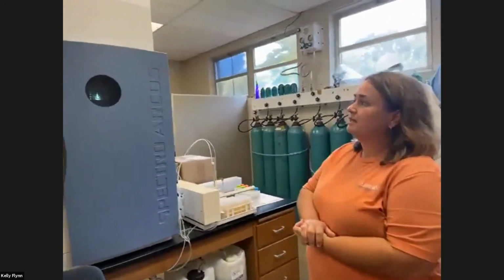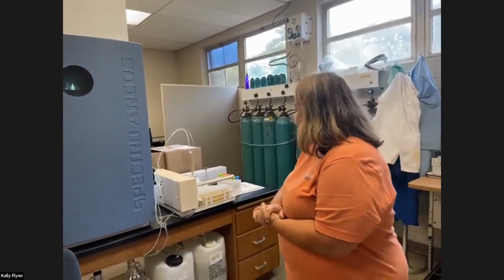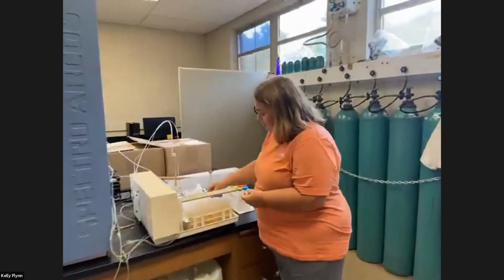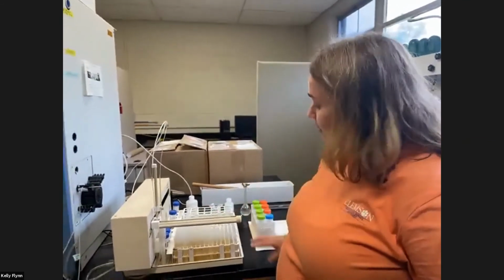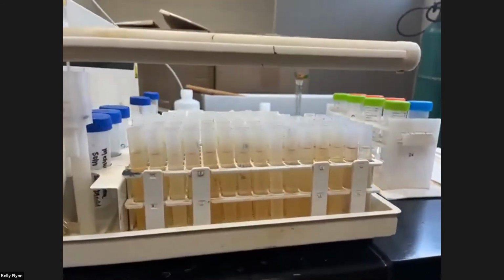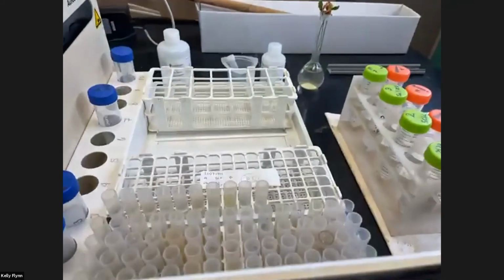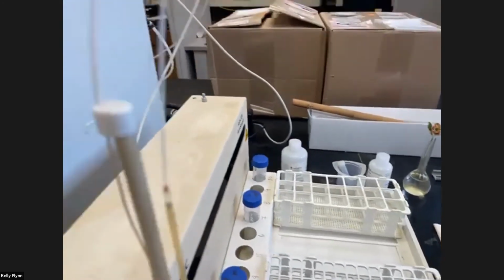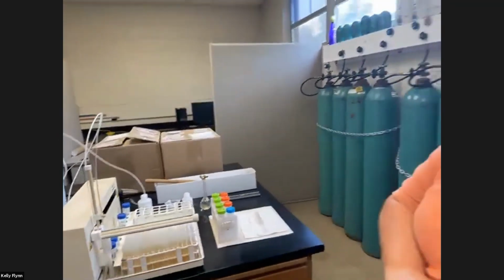This is our ICP, inductively coupled plasma. If you remember, Shannon mentioned that we have these tubes in the funnel. So that's what we end up with. We end up with 100 samples that are in the batch. We have to be really careful, everything stays in the right order. So we started out with that solid sample, and we added that extraction solution. So we end up with a liquid sample that we are going to actually run on the instrument.